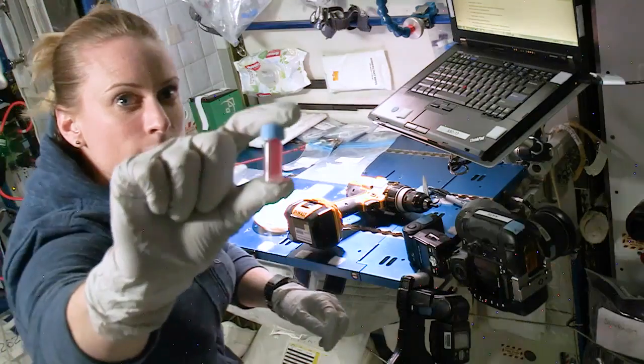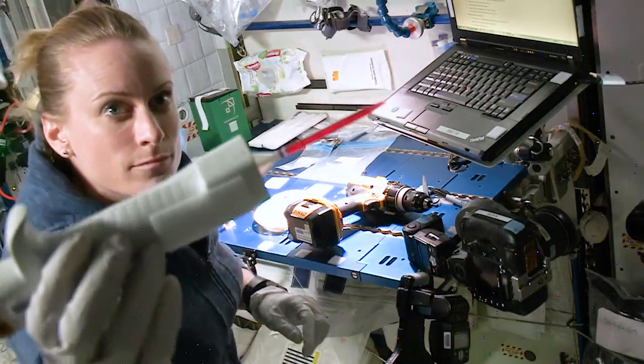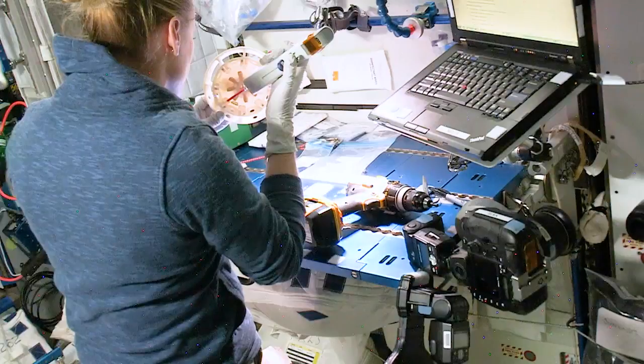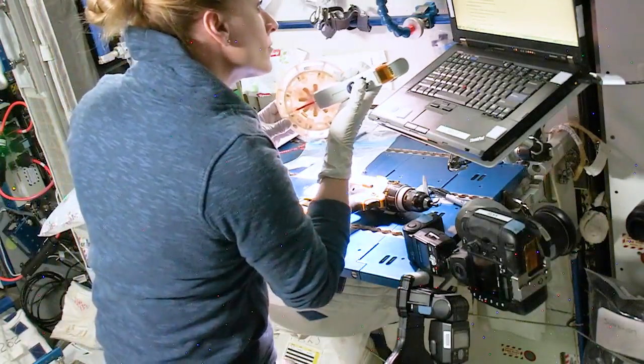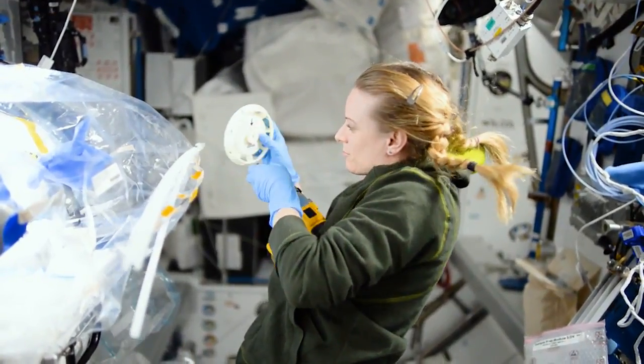Kate Rubens, who collaborated with us on this, extended those observations, and she did all sorts of pipetting and DNA handling during her 6 months in space, and showed even more clearly that this is actually very easy to do, and it really should be part of the toolkit that astronauts have. And that's going to open many doors for future experiments on the space station.